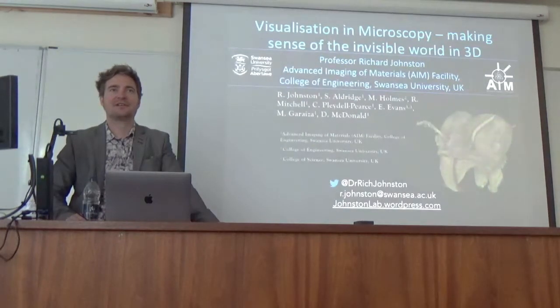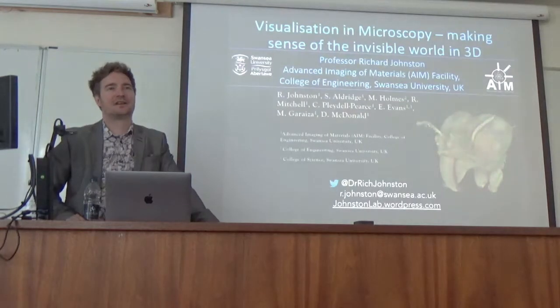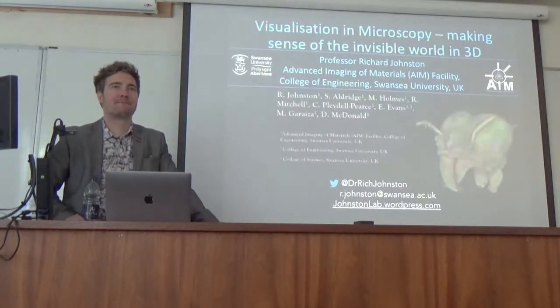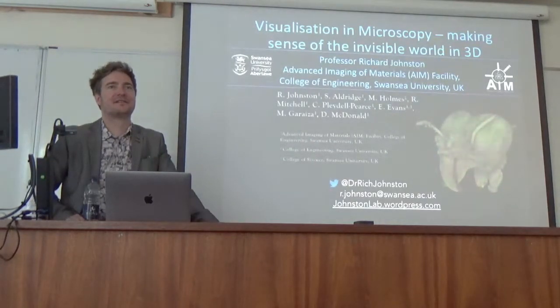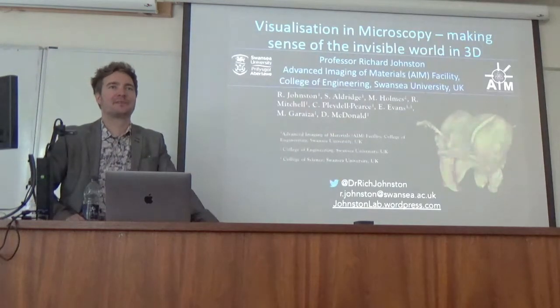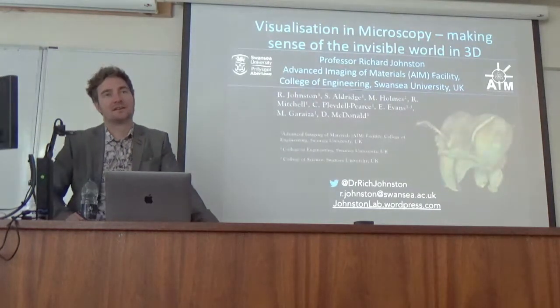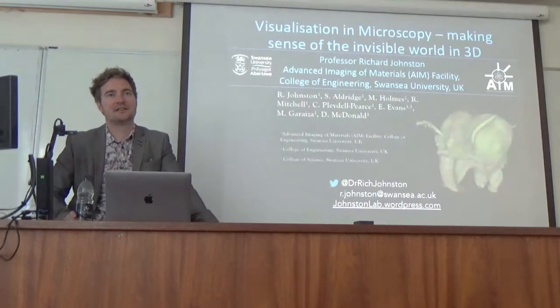I've got a general question. A lot of your visualizations had movement of the objects and fly-throughs, lots and lots of motion to compensate for the 2D. Yet that frustrates somebody who wants to do science on that particular object. They might have an aha moment, but they can't put a ruler on it. And I sort of heard the beginnings of where this goes next, where you give your researcher a VR tool so they can drive themselves to where they want to be in that object, and they're not frustrated by it.